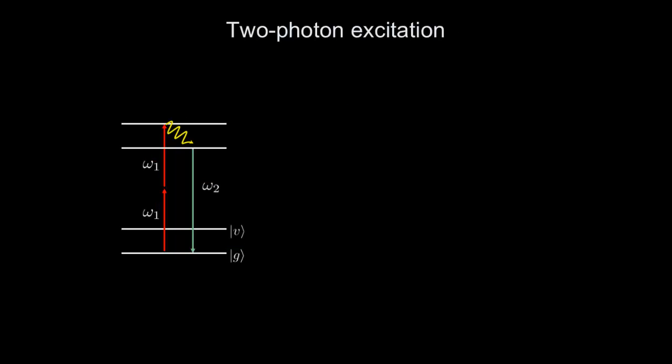Okay, two-photon excitation. Who has never heard of it? Everybody. Very good. So then I don't have to explain to you what this means. Two photons in, a little bit of structural relaxation, heat relaxation here, and then you see emission of a photon. That's your fluorescence photon.